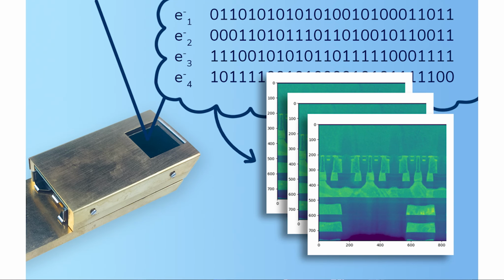So out of the detector you have already the stream of digital data, not as in traditional cameras that are used in electron microscopy, and based on that we are able to do a lot of digital kind of tricks, I would say, to keep it very simple. This illustrates the mode of operation. So really for every single electron we get just the 1s and 0s for that event, more precisely 48 bits per event that you detected on your detector.